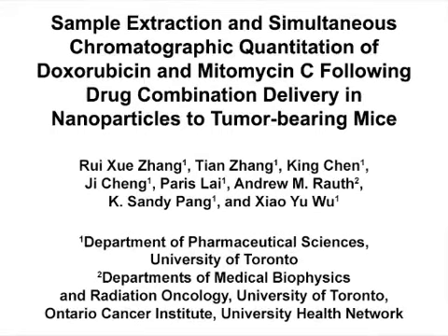The overall goal of this analytical protocol is to simultaneously extract and quantitate the two anti-cancer drugs, Doxorubicin and Mitomycin C, co-delivered by polymer lipid hybrid nanoparticles, and the doxorubicin's metabolite, doxorubicinol, in biological matrices, using a simple and robust reversed-phase high-performance liquid chromatography method.